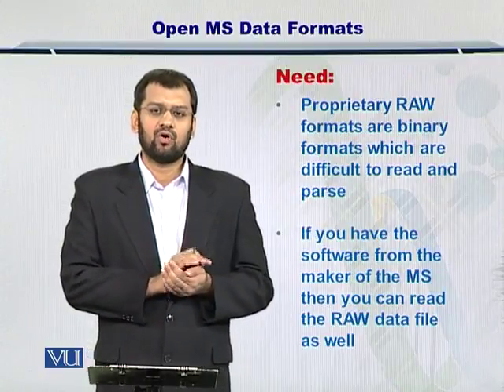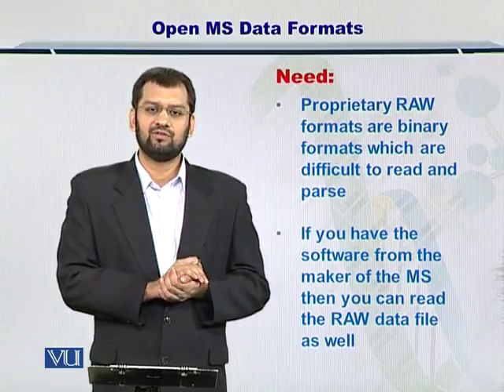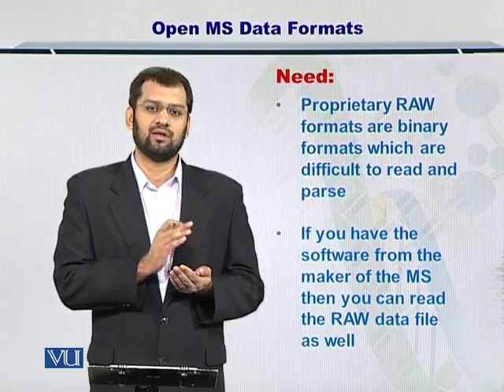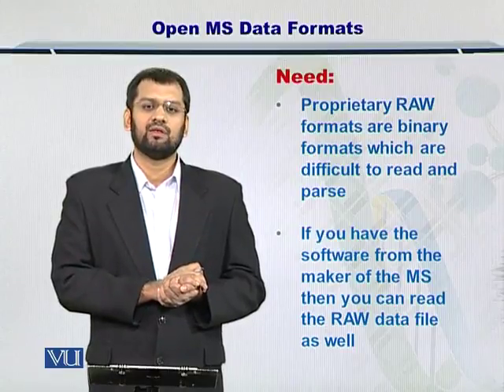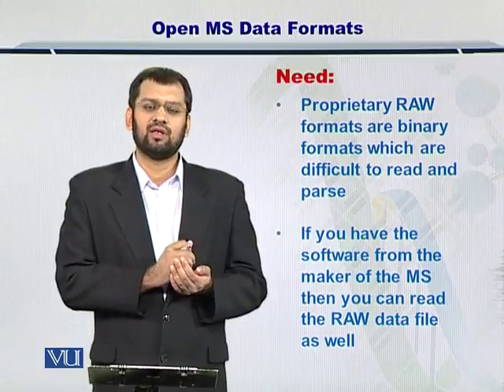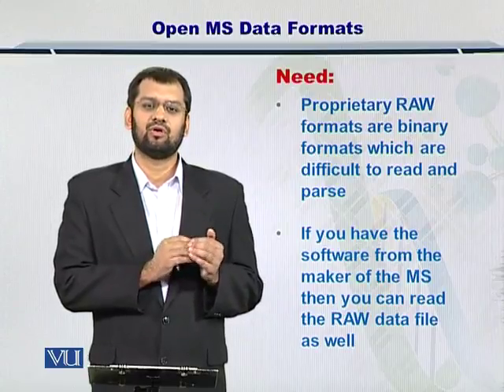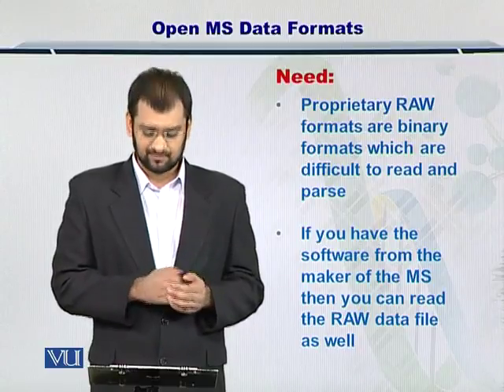Moreover, the raw file formats are proprietary. So you don't know exactly what the instrument manufacturer has done in its format and how the company has organized the data in the format. Therefore, your software will need to be written in consultation with the instrument manufacturer. But that is seldom the case, and therefore raw file format processing is extremely difficult.